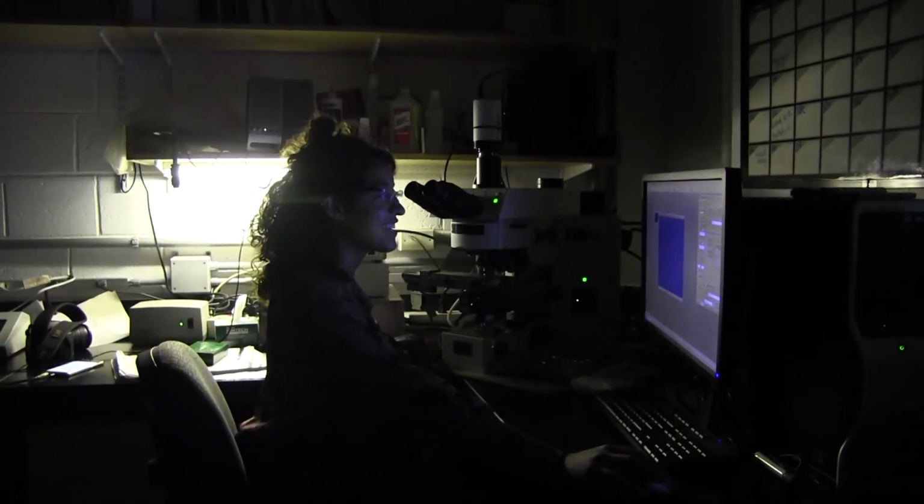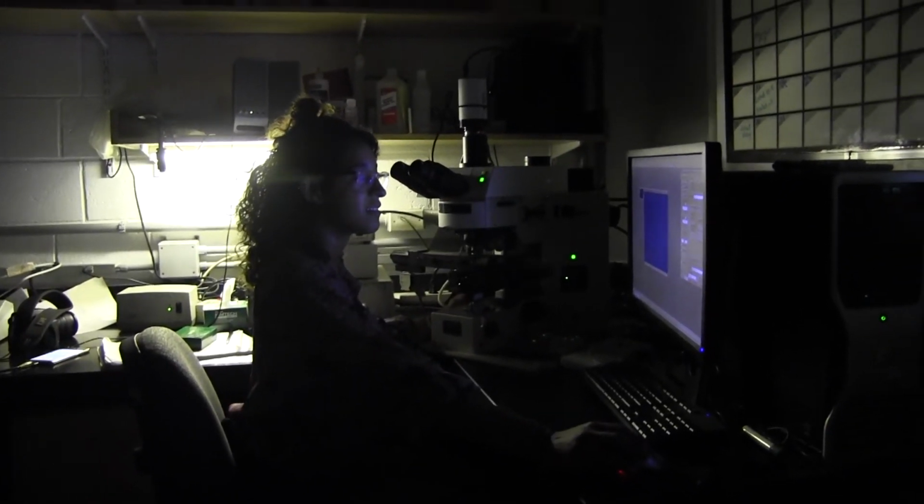And then once all the slides are made, we just go into the microscope room and we count them manually. There's a grid in the eyepiece of the microscope, and we count a certain number of rows until we get to about 16 cells.